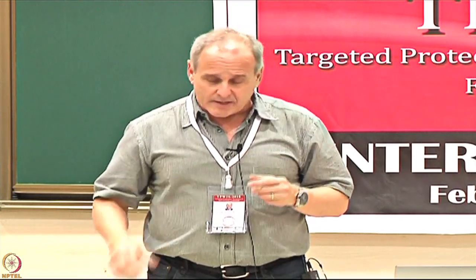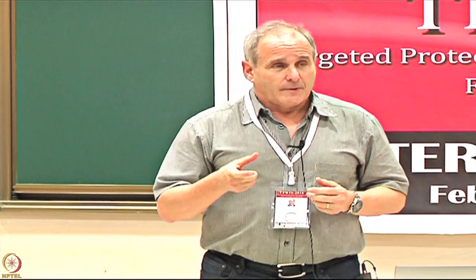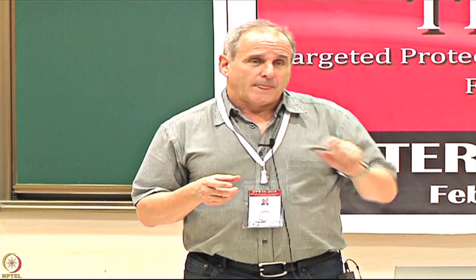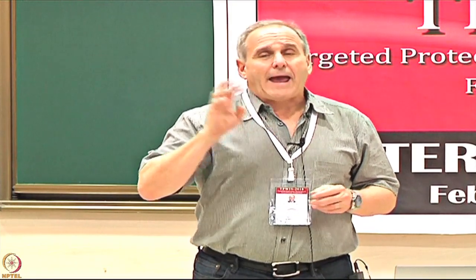So now we talked about the advantages of making fresh proteins, getting different classes of proteins well expressed, and looking at the proteins being folded by natural chaperone proteins and natural lysate. Now what we need to know is, if I do this experiment today and I do it next week, will I get the same answer? And so the way we went about testing that was we created a control sample. To make a control sample, we took several sera from different individuals, mixed them together to make a large volume of a mixed sample that would have a lot of responses.